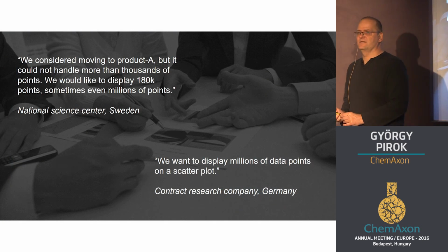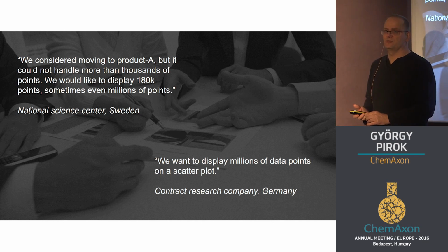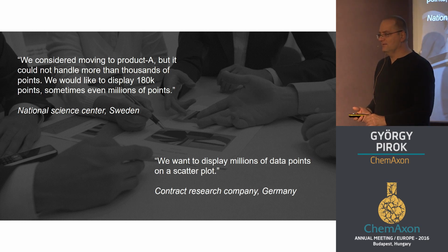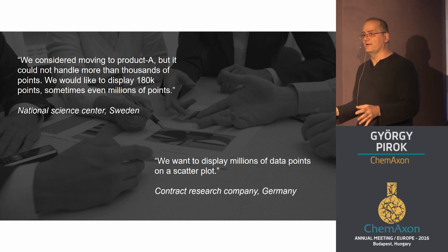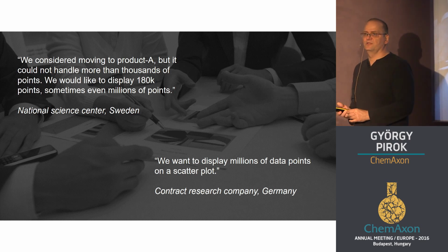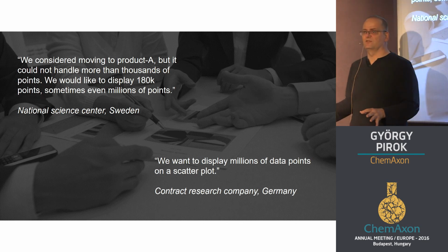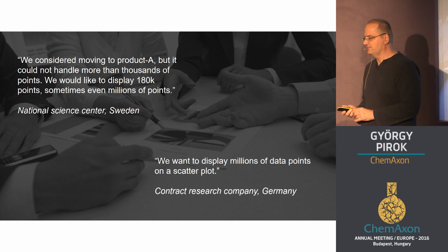When we started developing this tool, we approached some companies and tried to interview them about what kind of data visualization they use, either with software or on paper. And there was one interesting point which came out quite often. So one company said that they wanted to move to a visualization software, but it couldn't handle more than a few thousand points, because then it became quite slow. It wasn't interactive at all. They couldn't use it. That was a problem, so they didn't purchase it.